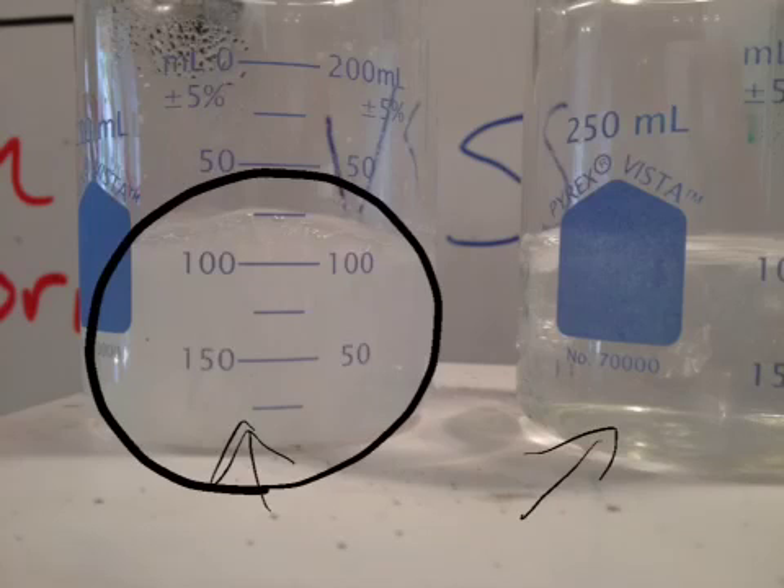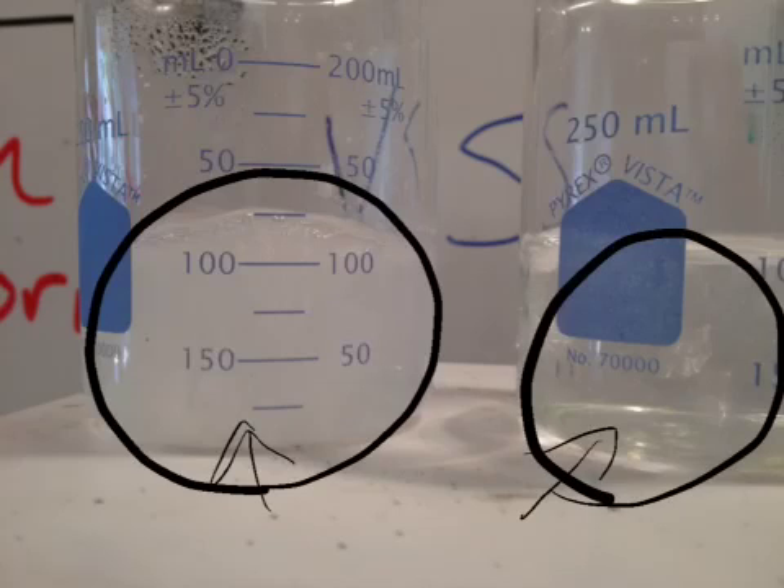The sodium chloride on the left is very close to being supersaturated — you're getting precipitation in the solution, which means even though it's boiling, the salt crystals are starting to form. Solids forming in solution is what precipitation means. On the other side, you can see that the water is still fairly clear, so you probably want to add a little more magnesium sulfate to see what happens.